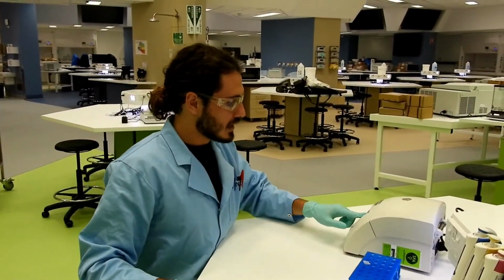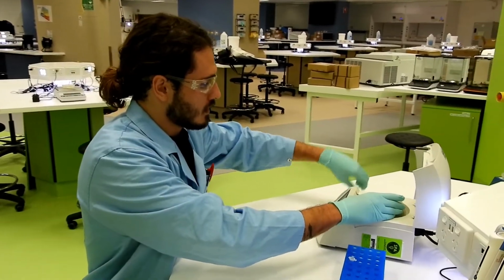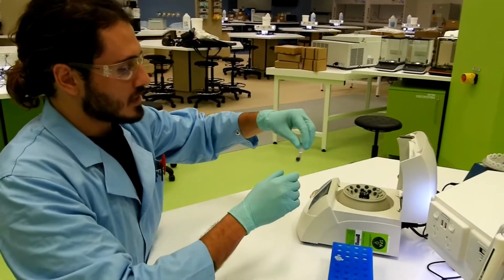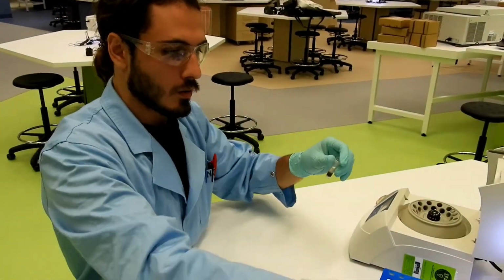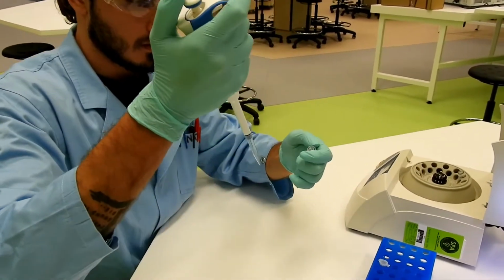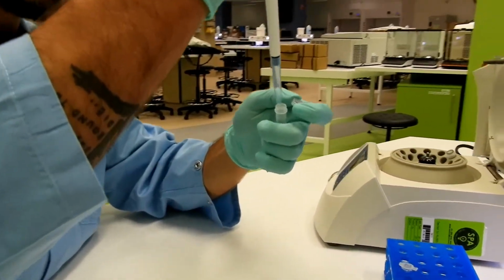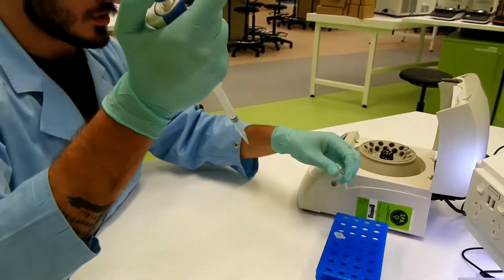So we'll next take our sample from the centrifuge, being careful to retain the separation of the supernatant and the pellet. We'll take 400 microliters of the supernatant and transfer it to a clean Eppendorf tube.